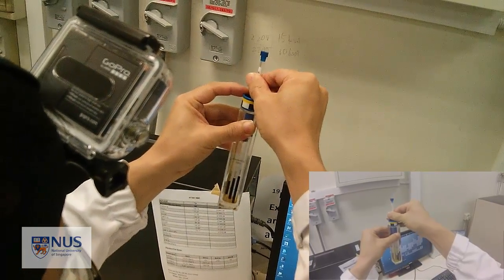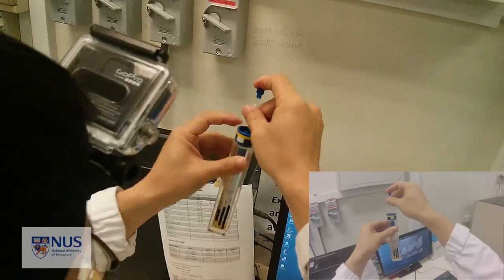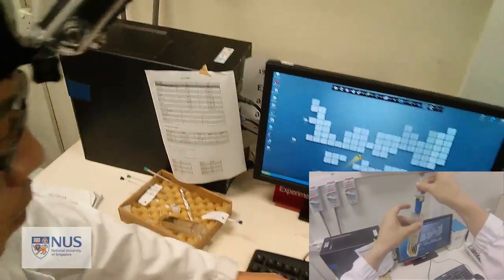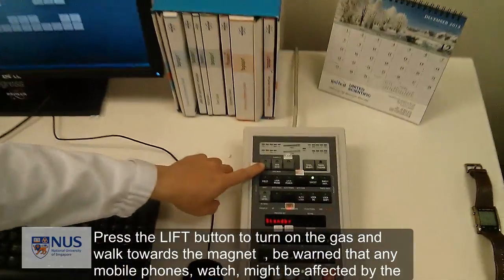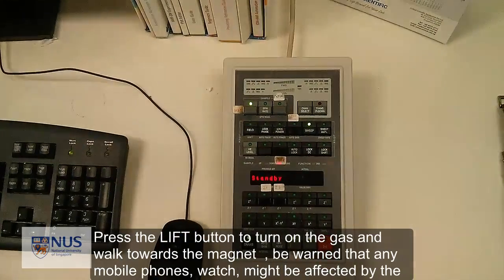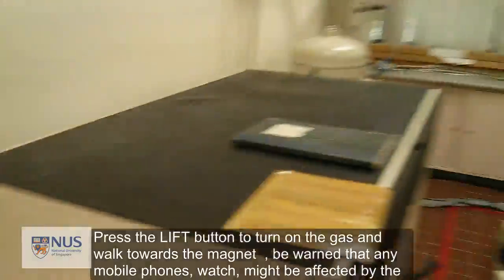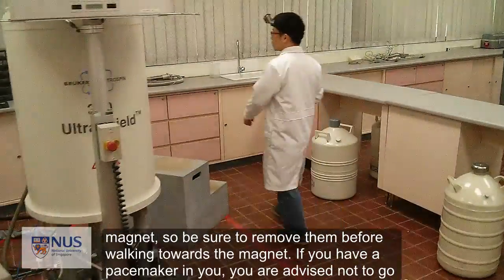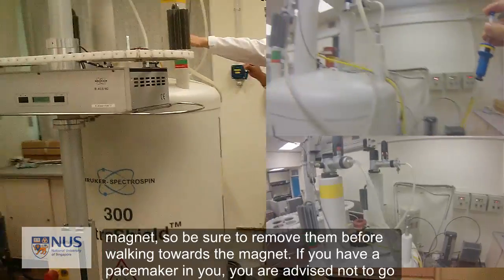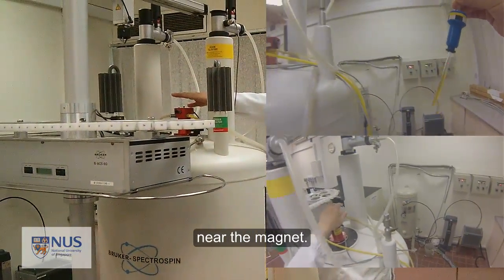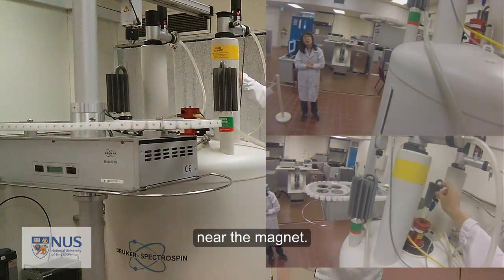If you have a pacemaker, you are advised not to go near the magnet. Press the lift button to turn on the gas and walk towards the magnet. Be warned that any mobile phones or watches might be affected by the magnet, so be sure to remove them before walking towards the magnet.